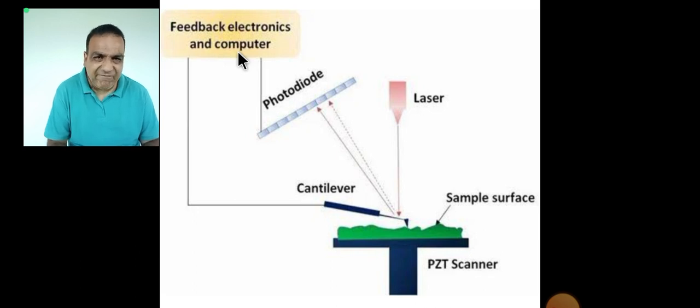These AFM systems provide tools for quantitative measurements, surface manipulations, force spectroscopy, and other advanced image techniques. It's worth noting that this atomic force microscope works under ambient conditions, meaning samples can be imaged in air or liquid environment. Additionally, AFM can be used to study a wide range of materials, including semiconductors, polymers, biological samples, and so on.